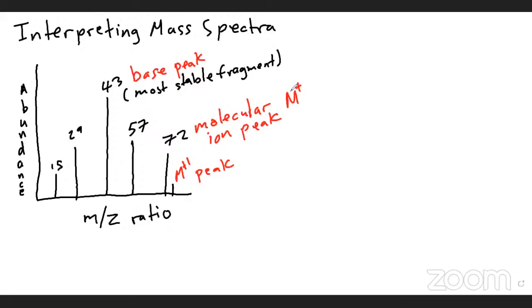So remember now, an ion is formed when any species loses an electron. So if you have an atom, the atom loses an electron, you get an ion. When the molecule loses an electron, that's how you get the molecular ion. So for tonight, we are focusing on this chart here and others.